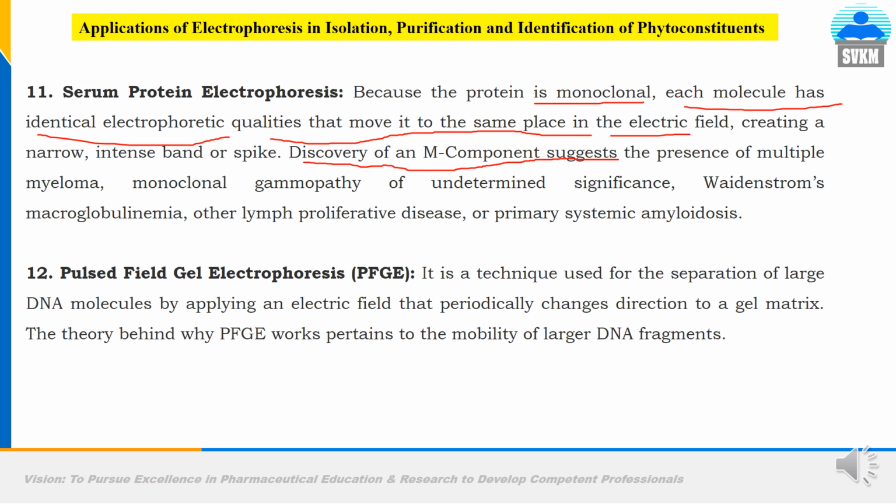The last electrophoresis technique is called pulsed field electrophoresis. It is a technique used for the separation of large DNA molecules by applying an electric field that periodically changes direction to a gel matrix. The theory behind why PFGE works pertains to the mobility of large fragments.